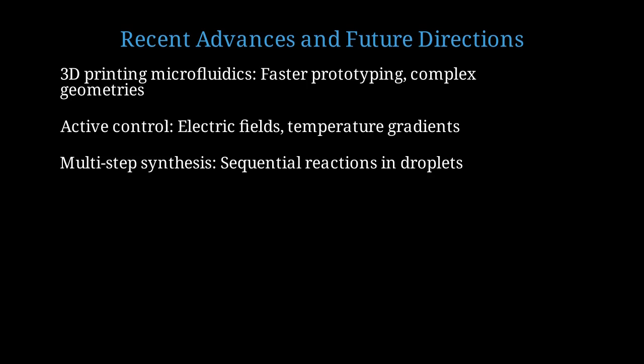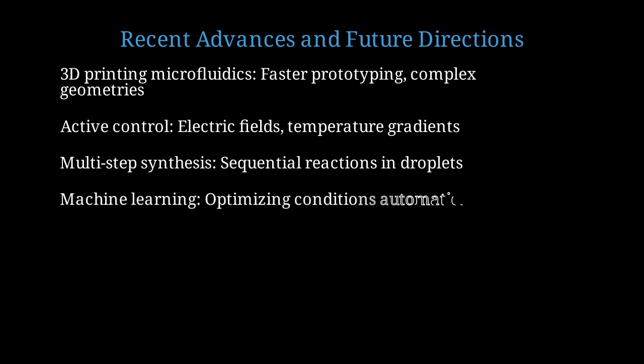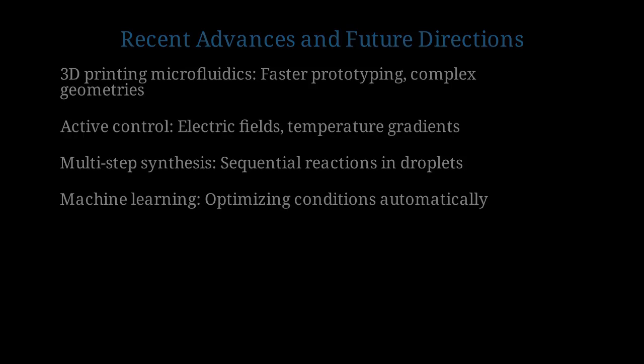Multi-step synthesis and segmented flow enables complex chemistries. Each droplet passes through zones with different conditions, building up complexity. Machine learning algorithms are being integrated to automatically optimize synthesis conditions, dramatically accelerating the discovery of new materials.